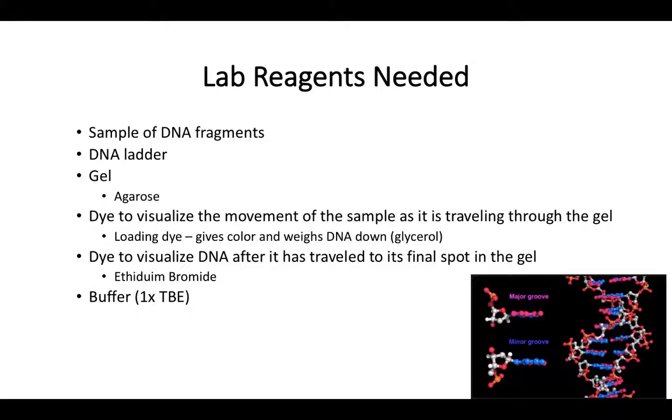So when using ethidium bromide, or actually this entire lab, it's very important to use gloves, because ethidium bromide could be detrimental. When we make our gel and we have all our samples ready, before we insert our sample inside of our gel, we will need a buffer. That buffer is what deprotonates the DNA and helps that DNA dissolve in solution so it will be able to move through that gel.